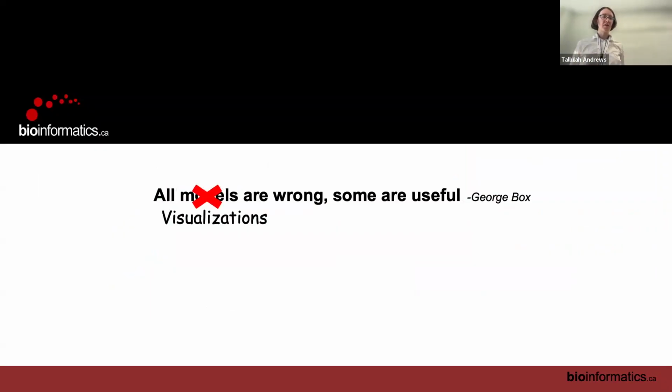Okay, so that's dimensionality reduction. Now we're going to talk about visualizations. So the goal of visualizations is not necessarily to preserve anything about our data. Our goal with visualization is to make a pretty picture that will give us some sort of insight about what's going on in our data.